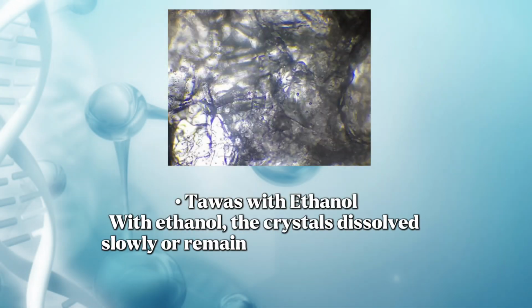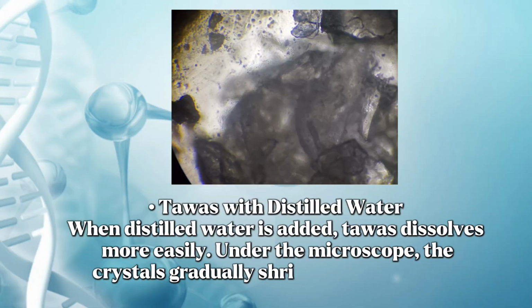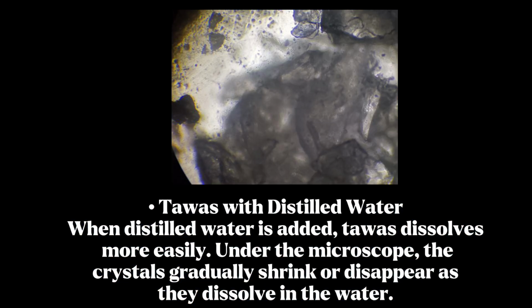Tawas with ethanol, the crystals dissolve slowly, or remain partially visible. The particles appear more scattered due to the liquid medium. Tawas with distilled water. When distilled water is added, tawas dissolves more easily.